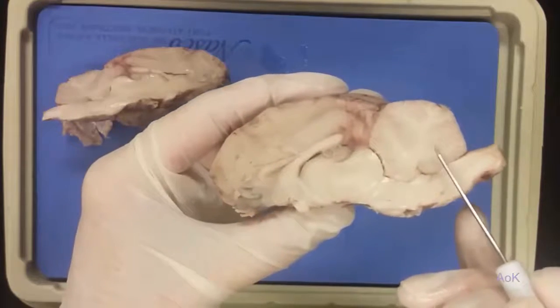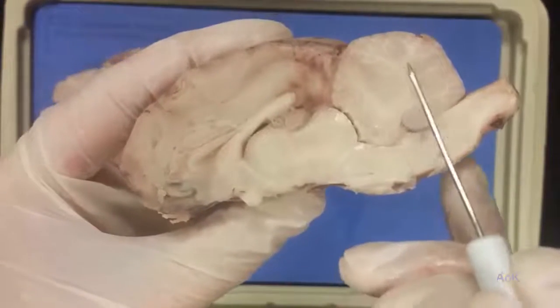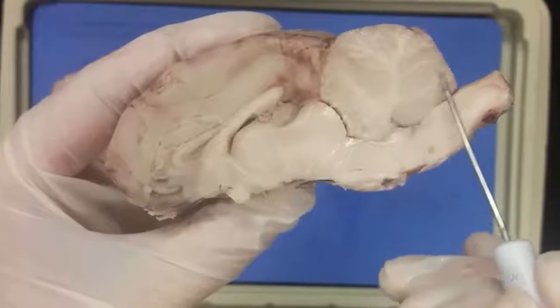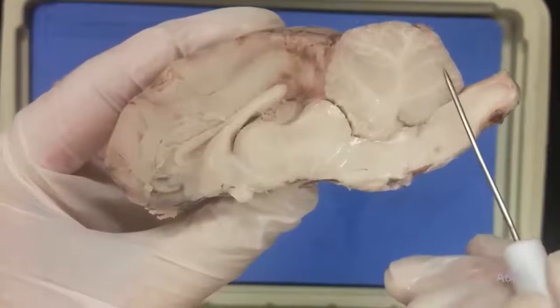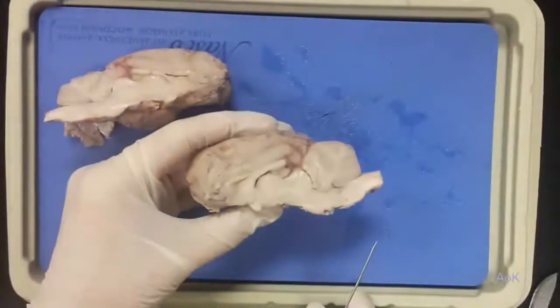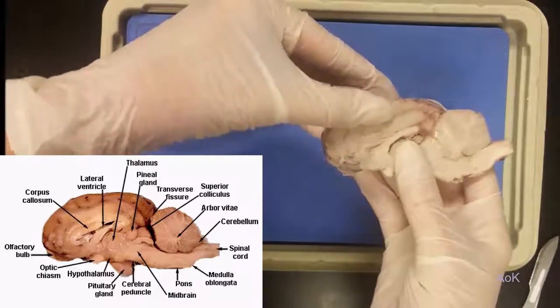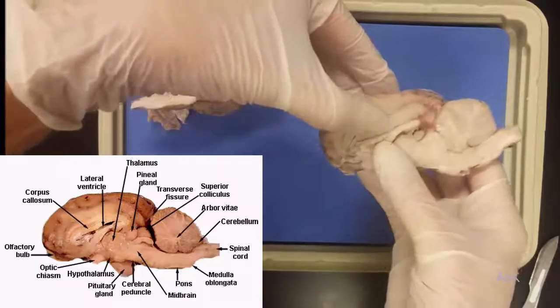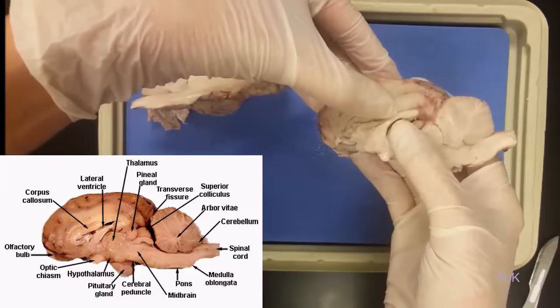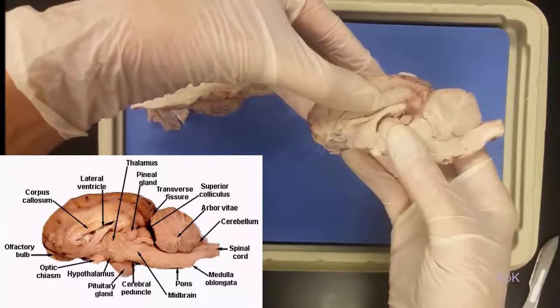It's really clear here with the cerebellum. You can see the very thin tree-like structures of the white matter and the dark matter, gray matter, sorry. And this is actually called arbor vitae. If you gently open the brain, you'll see some gaps. Those gaps are called ventricles, and the ventricles would be filled with cerebrospinal fluid in a living brain.